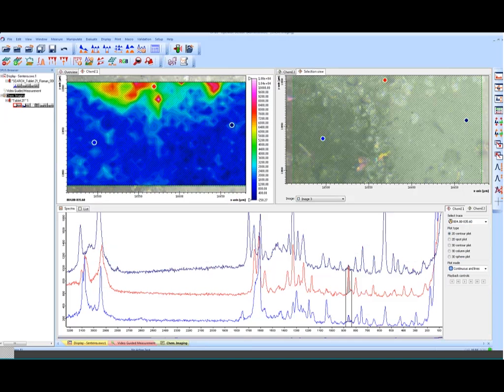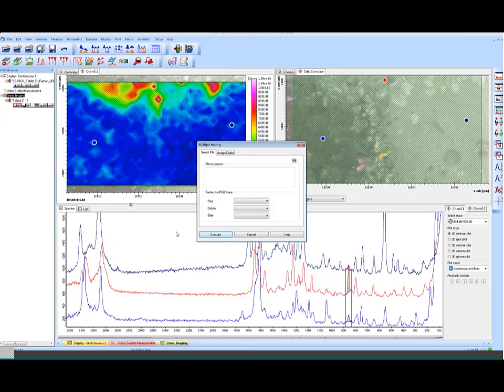So we had 3 different integration areas, and now the task would be to combine these 3 integration areas within one picture, and we call this RGB plot. So it's a quite straightforward procedure. One has to push this button here and put in the trace, and then choose the different ranges of interest here.